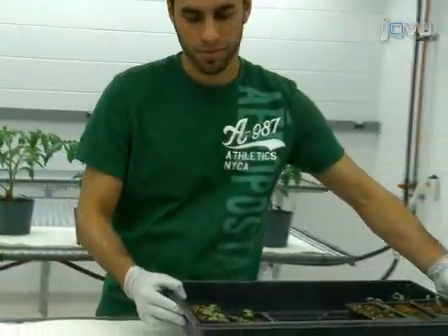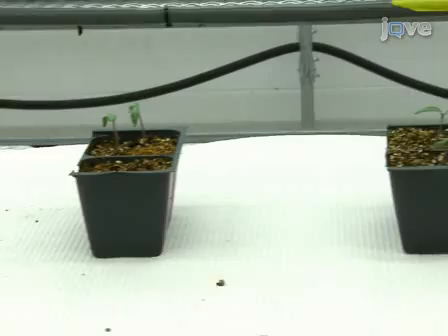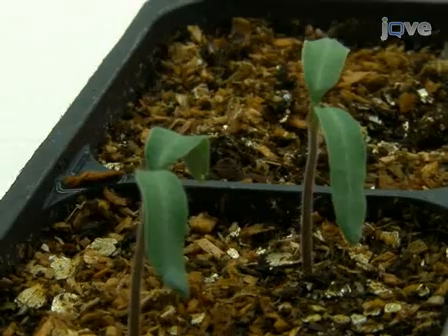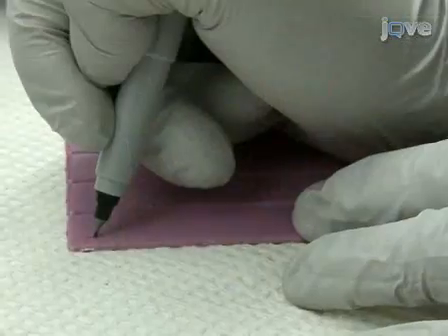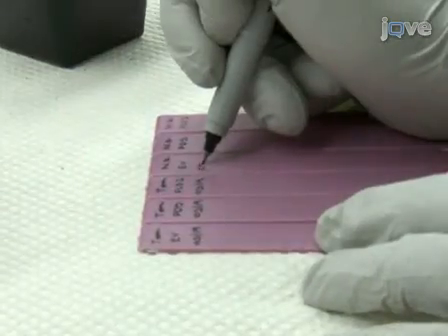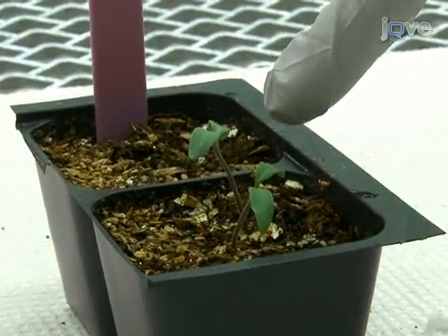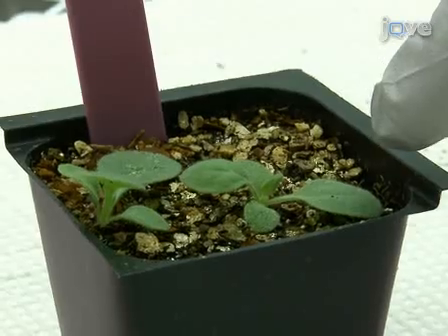N. benthamiana plants used for silencing should be around two and a half weeks old, when the cotyledons and the first two to four true leaves have emerged. Tomato plants are used seven to eight days post emergence, when the true leaves have not yet appeared. Label the seedlings to be infiltrated with the gene to be silenced and the date of the experiment. For tomato, infiltrate both cotyledons, and for N. benthamiana, infiltrate the biggest two true leaves.